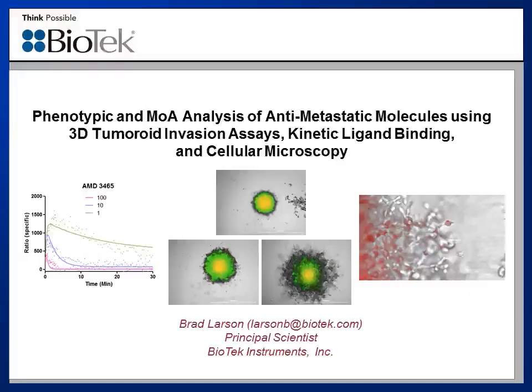The goal is to introduce you to combined solutions that enable the performance of phenotypic tumor invasion assays as well as mechanism of action analyses that provide high throughput, accurate, real-time results through the incorporation of cellular imaging and kinetic microplate reader detection.